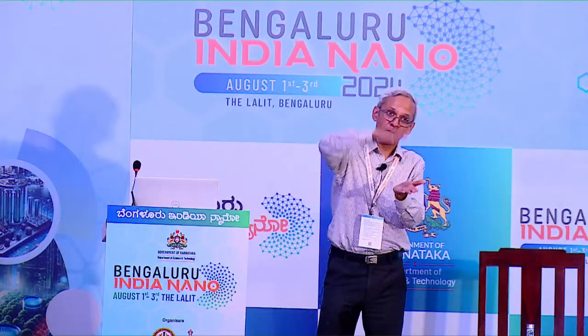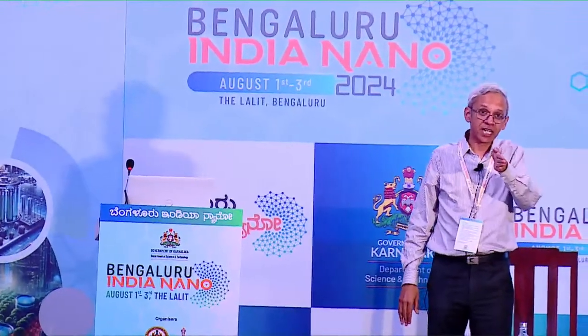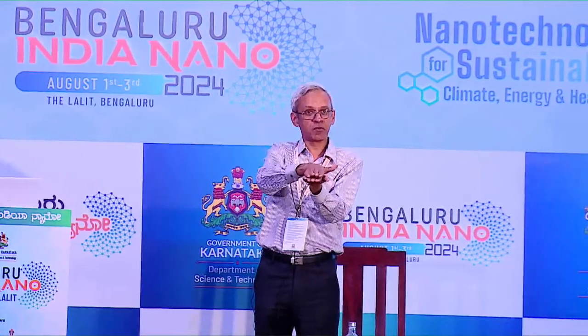Okay, so how many layers you form in a multi-layer structure. See, remember, when you want to see a multi-layer structure, you want to see it in cross-section. You can't look at it in plan view, because all the layers will be one on top of another. You want to look at the cross-section. One of the biggest challenges in multi-layer structures is to actually prepare the specimen.